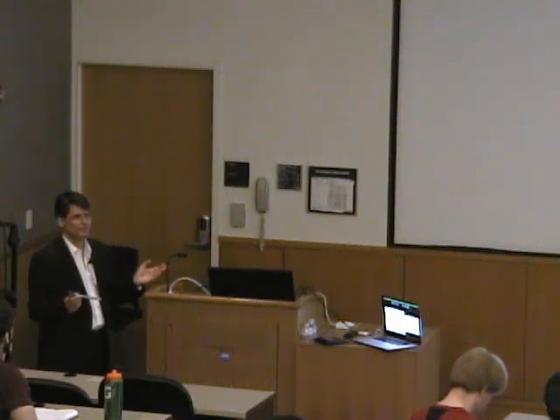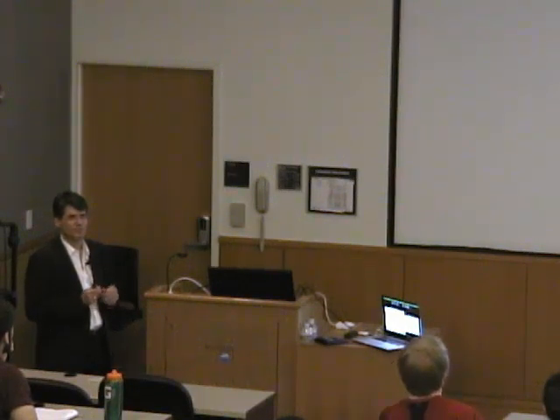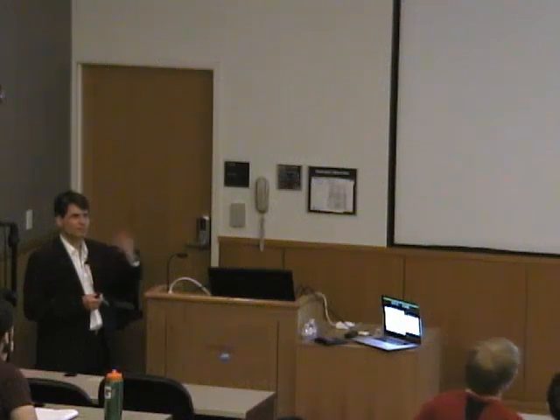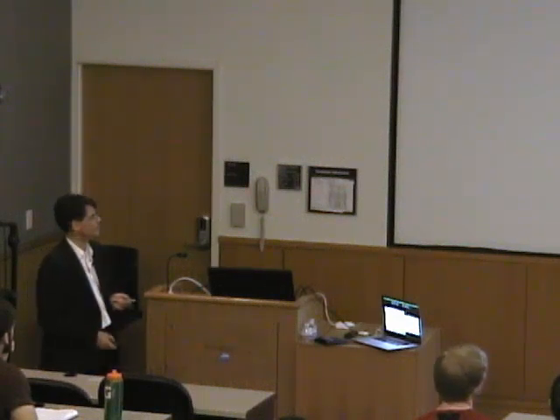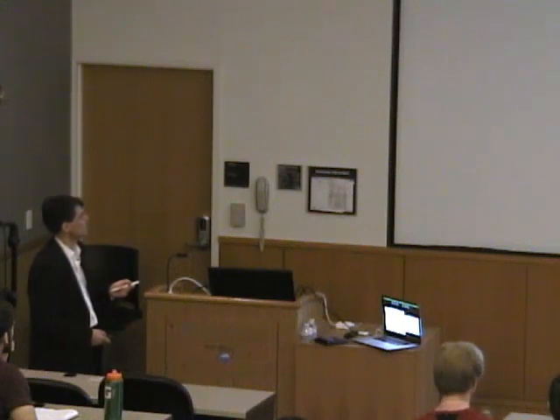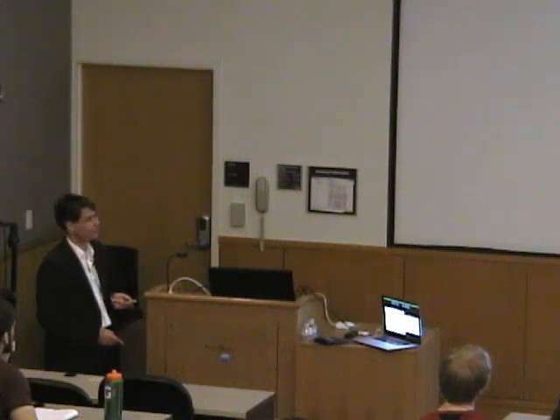I'm only saying that because people have done that a lot. There are really questionable papers, for example on nitrogenase, where people come out with a really wrong total spin by simply assuming that the system will behave like a Brillouin function, but that is not necessarily true. You need an independent confirmation that your zero field splitting is small, and then and only then can you fit a Brillouin function to the MCD to determine the total spin of the ground state.